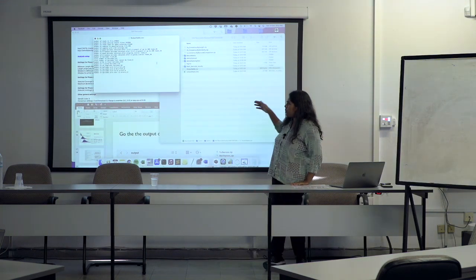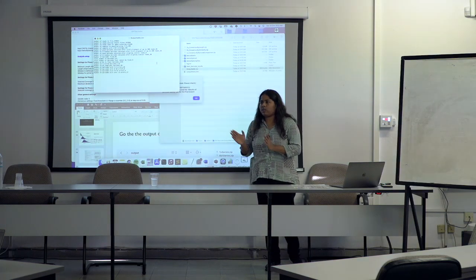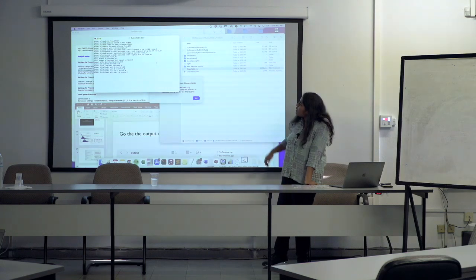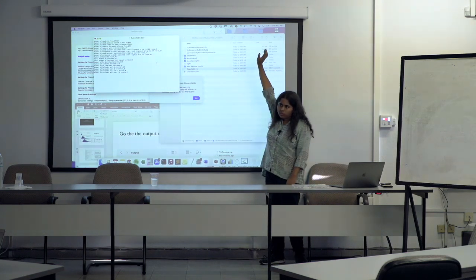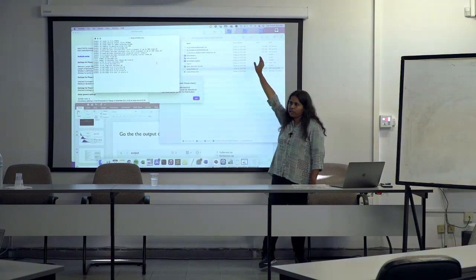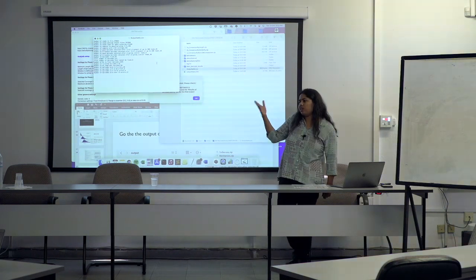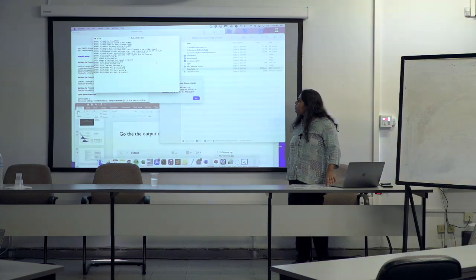It's far less variable today, but this is a 9.4 run, so that's probably also reducing it. All the reads that were used are stored, so you can trace back which reads were in there, and we can create a unique number for that set of reads too.